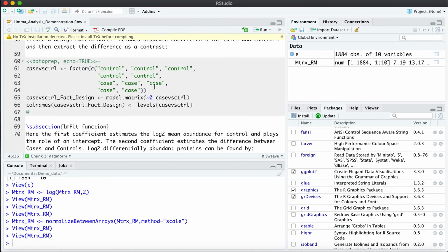This will be very important because the way that Limma works is that you give a design, stating what column corresponds to what group. That's why it's versatile in the kind of analysis you want to perform. In this scenario, we're just going to perform a two-group comparison. There are other analyses, such as two groups in two different experiments, called 2 by 2 factorial. But since most scenarios in bioinformatics are between cases and controls, just a simple comparison, this is the most basic design. Each one represents a column. You notice here that I have 5 controls and 5 cases, and those correspond to the ones in the matrix.